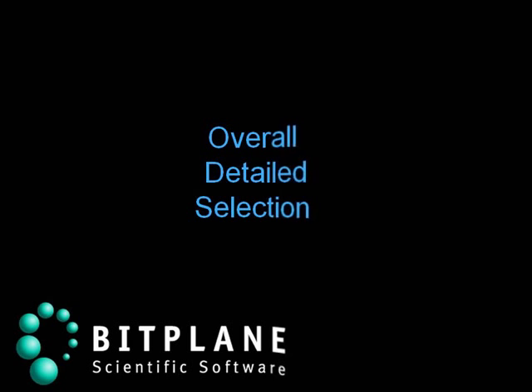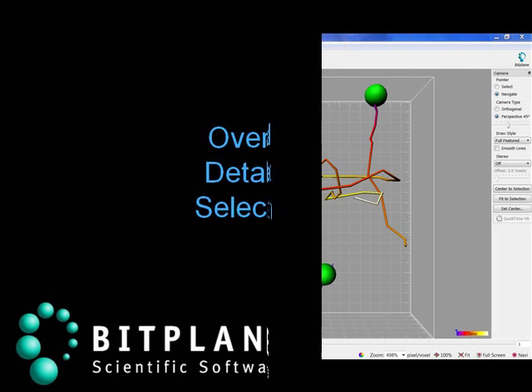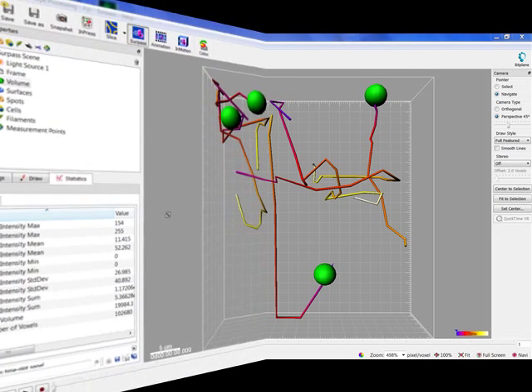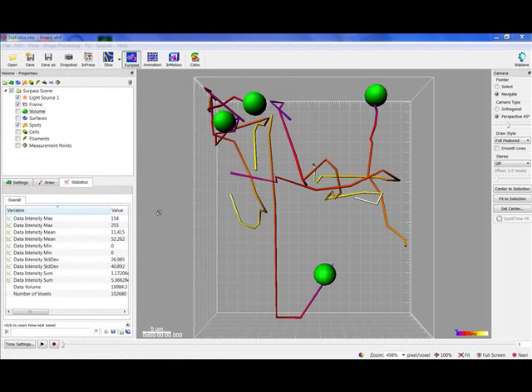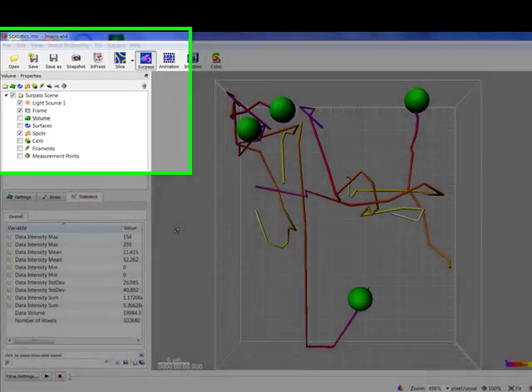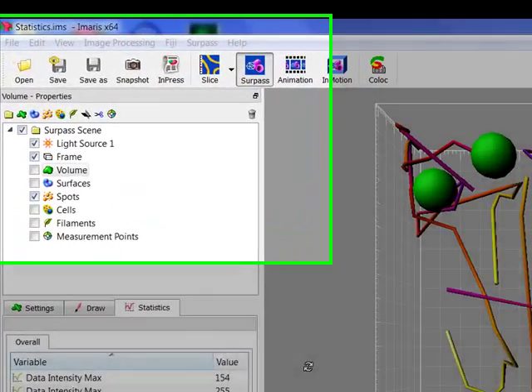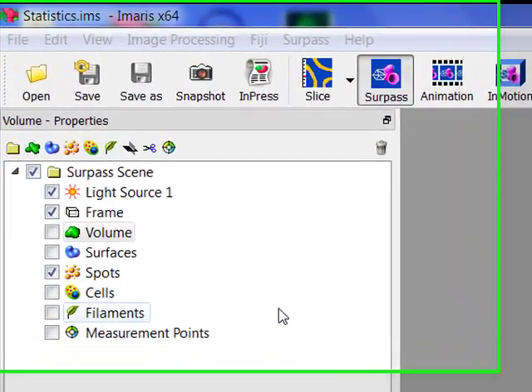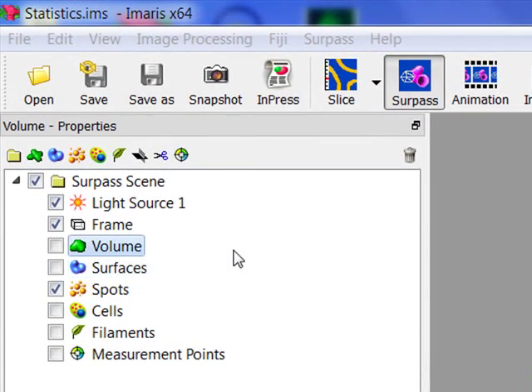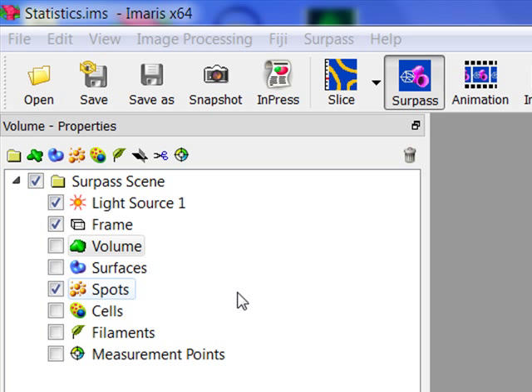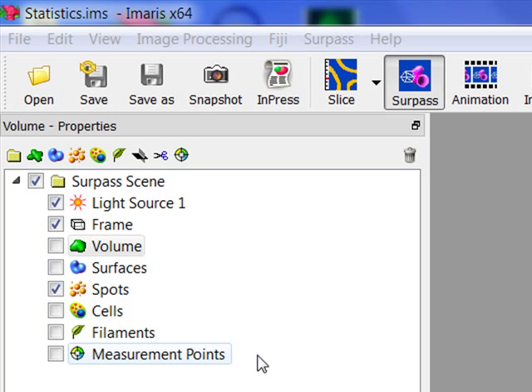The statistical values enable us to understand and compare different datasets through summarized numerical values. All the objects you create in IMARIS – volume, surfaces, spots, cells, filaments, and measurement point – have their own statistical values calculated.